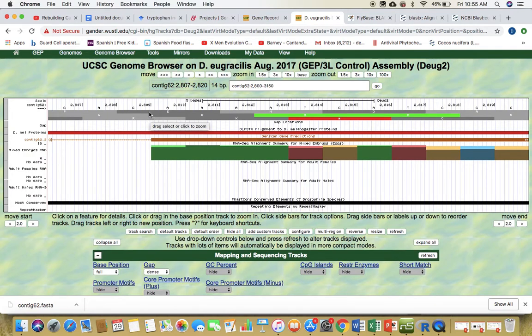Frame 2, looking to the right, the next amino acid starts where? At a phase of 0. The AG ends right here, so there is no letter between the AG and the next amino acid in frame 2.